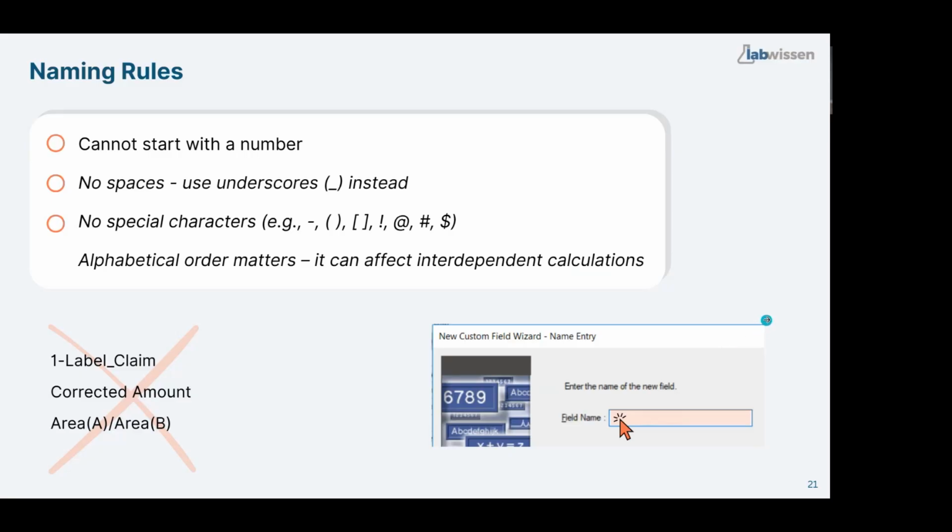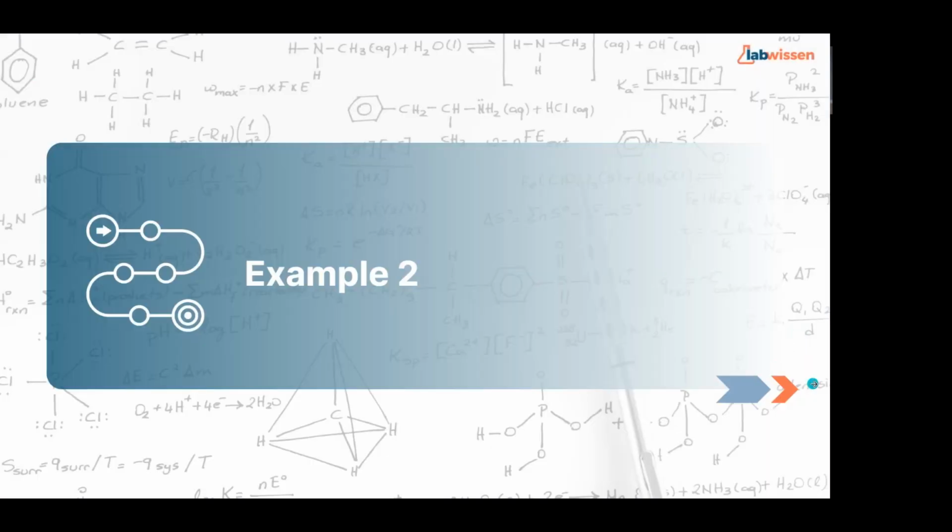Yes. So I see here in the chat a question from Rakesh: this will be used while creating a new sample set. I think you mean the custom field that we created that refers to the sample set. Yes, we can put the sample set information when creating a new sample set, but also to sample sets that already exist. I hope I answered your question. So let's go further to example number 2. I'll give you one moment to write any questions you had about example number 1.